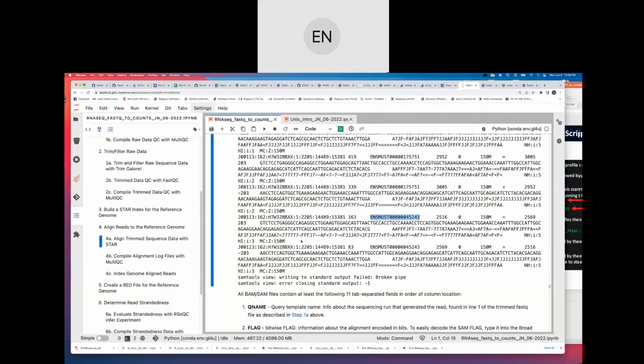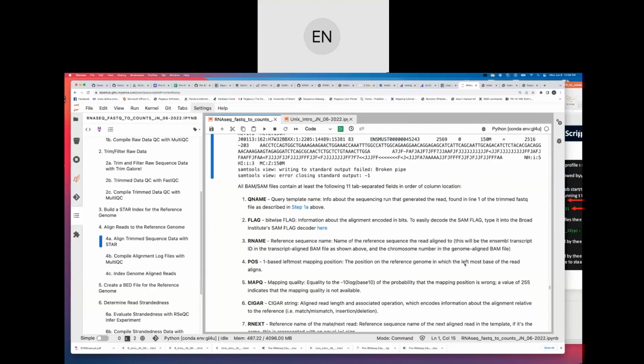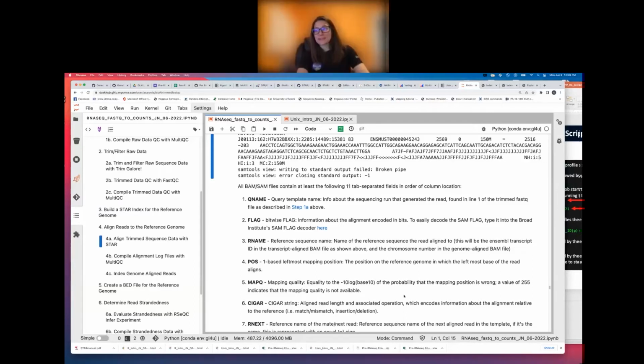But when you look at the map quality, which I guess you can look at, some have 0s and some have 3s. Is that going to help with the tiebreaker, or how do you reconcile that? Do you care? Do you say it maps to everything? Good question. Presumably there was only one transcript it came from when you sequenced. We're just trying to figure out where these puzzle pieces came from.